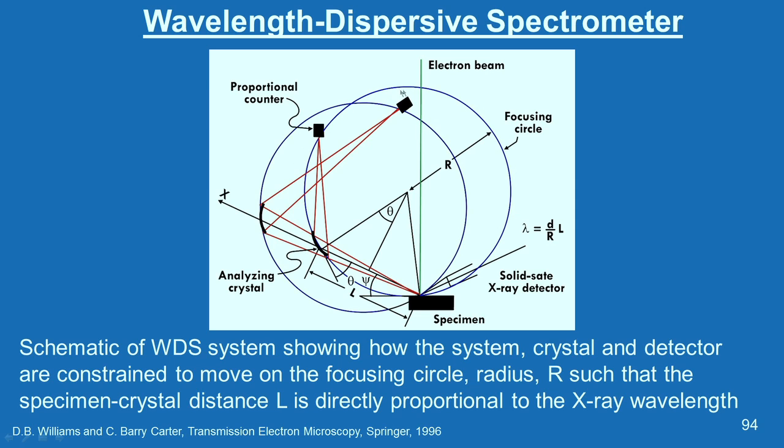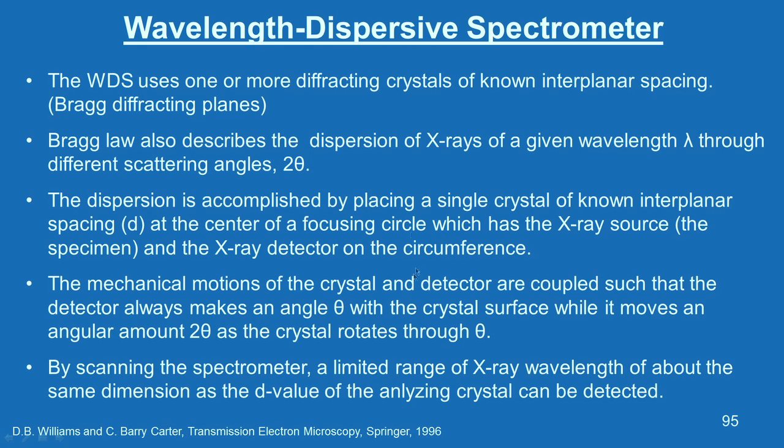You follow this one circle, and for the other configuration, I mean the change in theta to 2 theta, then you follow the next circle. They are kept in this manner. Why do we keep this in this position? That we will see now.